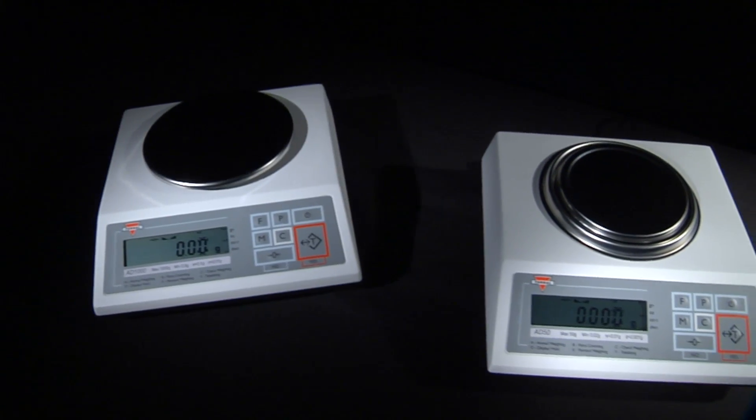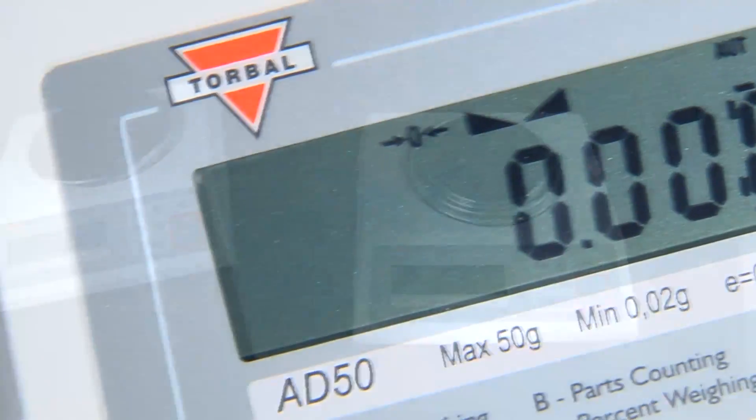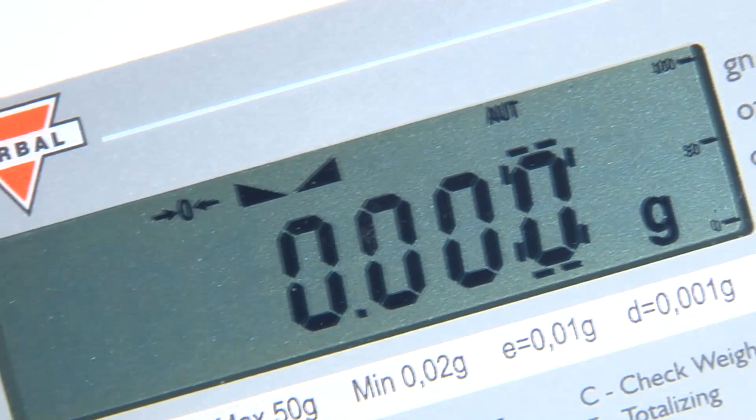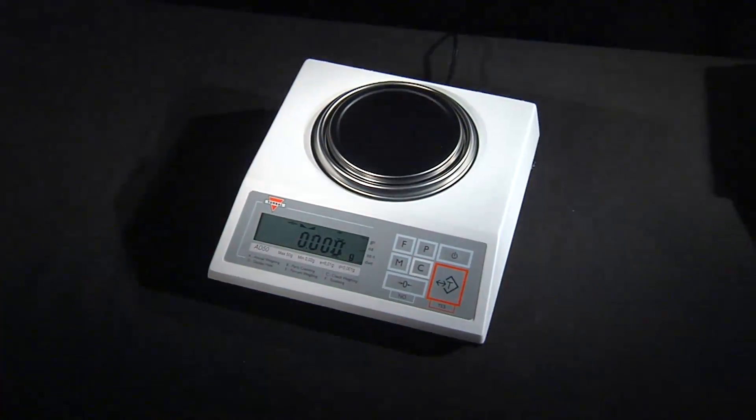The AD series scales are equipped with a large, seven segment LCD display that ensures excellent visibility of weighing results.